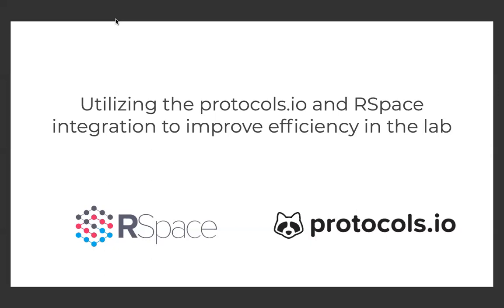Great. Thank you for joining us for our webinar with RSpace and Protocols.io. This webinar is about utilizing the Protocols.io and RSpace integration and overall improving efficiency in the lab.